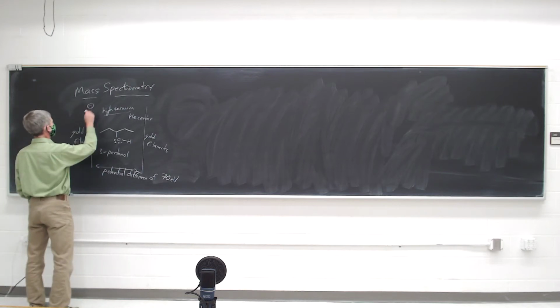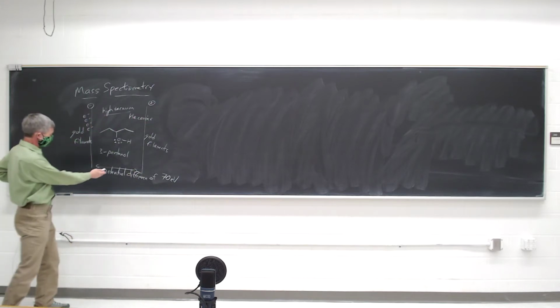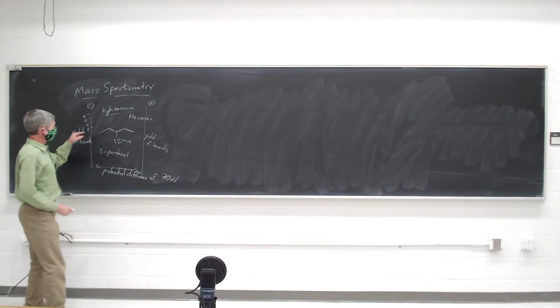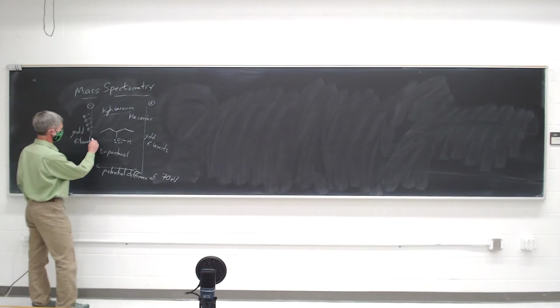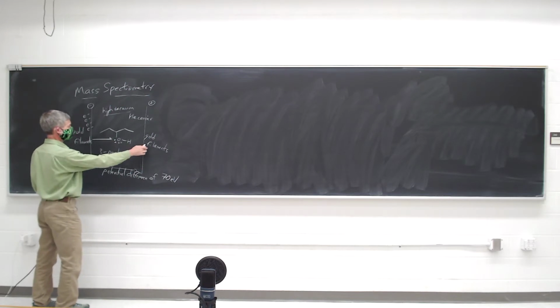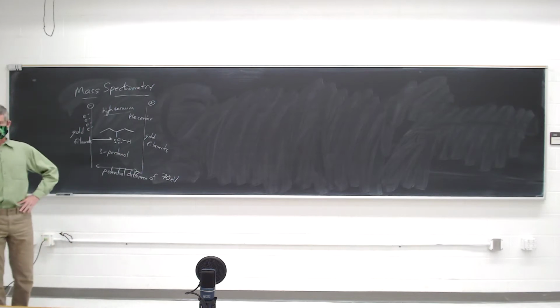Electrons will build up on the negatively charged filament, and eventually, because this potential difference is so large, the electrons will build up enough on this filament that they're going to go shooting across. Okay? So we have an electron which is on its way from the negative filament to the gold filament. Most of the time, it will just shoot across.